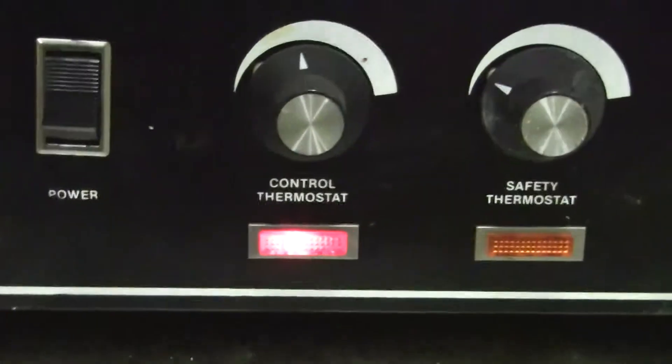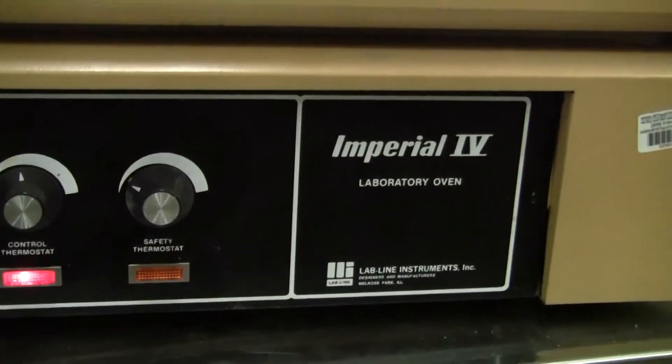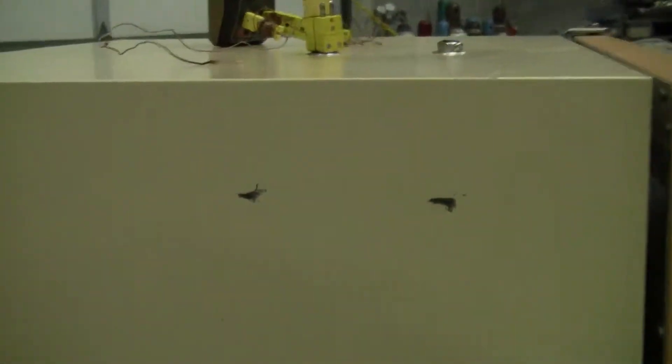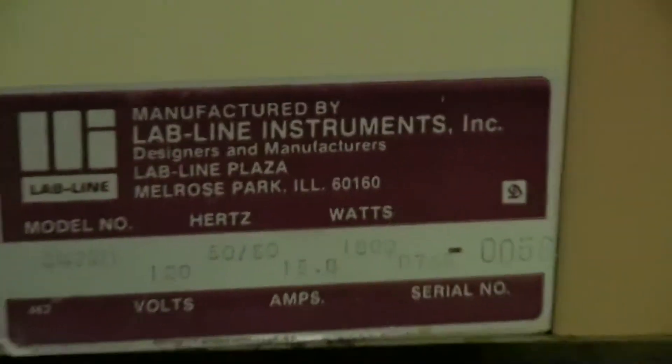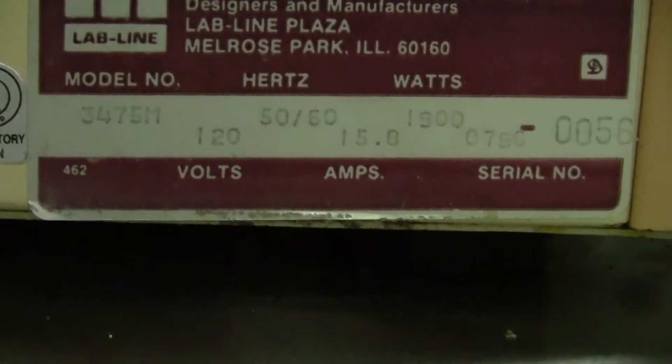Let's take a look around the side. There's our control and our over-temp protection power switch. You can see it's an Imperial 4 Laboratory Oven. The unit's pretty clean on the sides. If you take a look down here at this tag, you can see United Laboratory Certification, manufactured by LabLine Instruments, and these are all of our specifications.